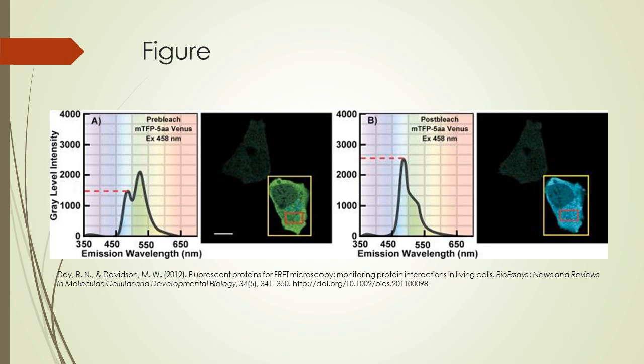In this experiment, the discussion was that there were various methods that had proven to be reliable for measuring protein interactions by FRET microscopy, highlighting the advantages and limitations of each method, and the most useful FP candidate for FRET microscopy.